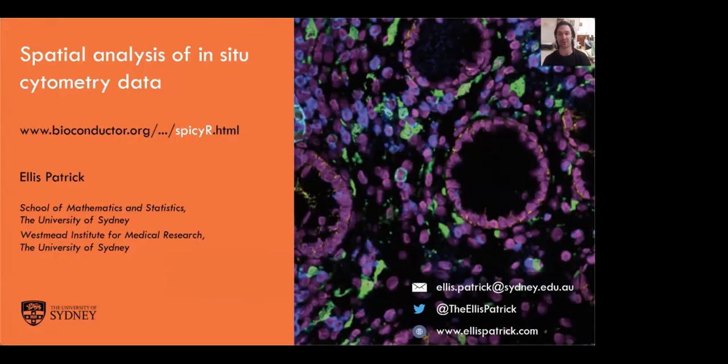I hope the other talks in this session have stoked your excitement for spatial omics data. Not just because of the awesome science these technologies will enable, but also because of the exciting analytical and computational challenges that will come along with them. And so in this talk, I'll be giving a big picture overview of two analytical methods we've developed for quantifying spatial relationships between cells. On the right here, we have a standard 3-color image of cells in some colorectal tissue.